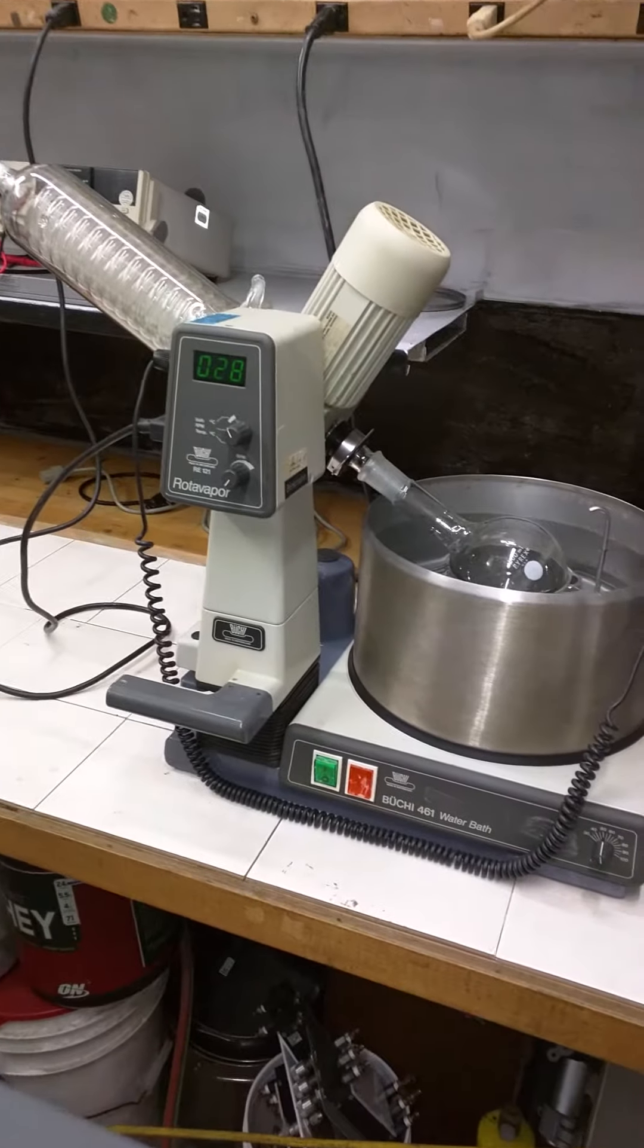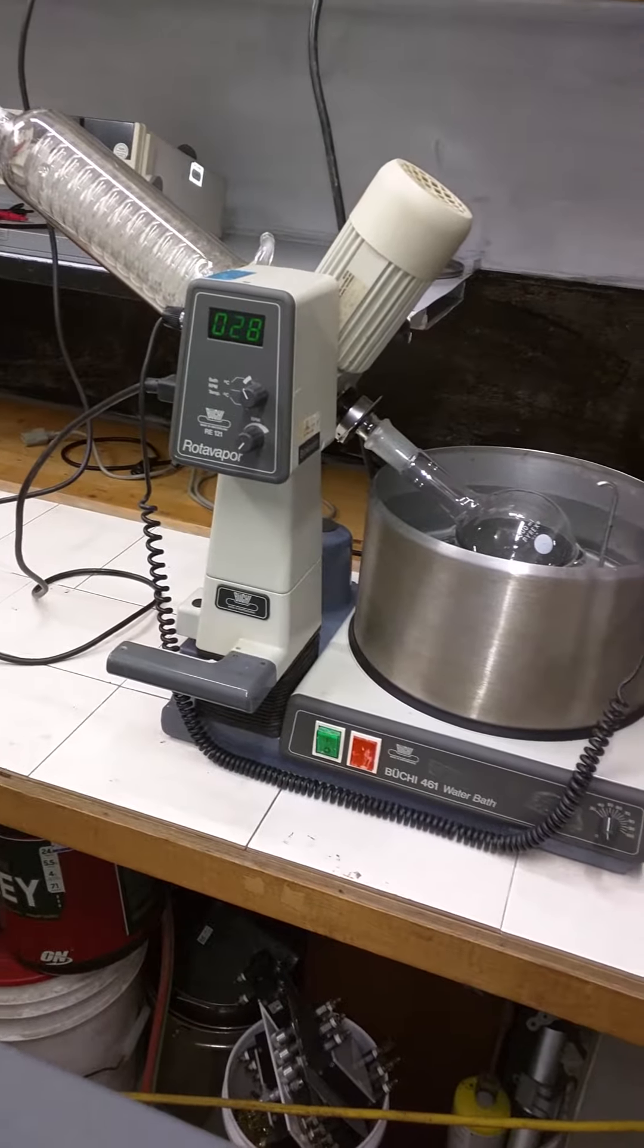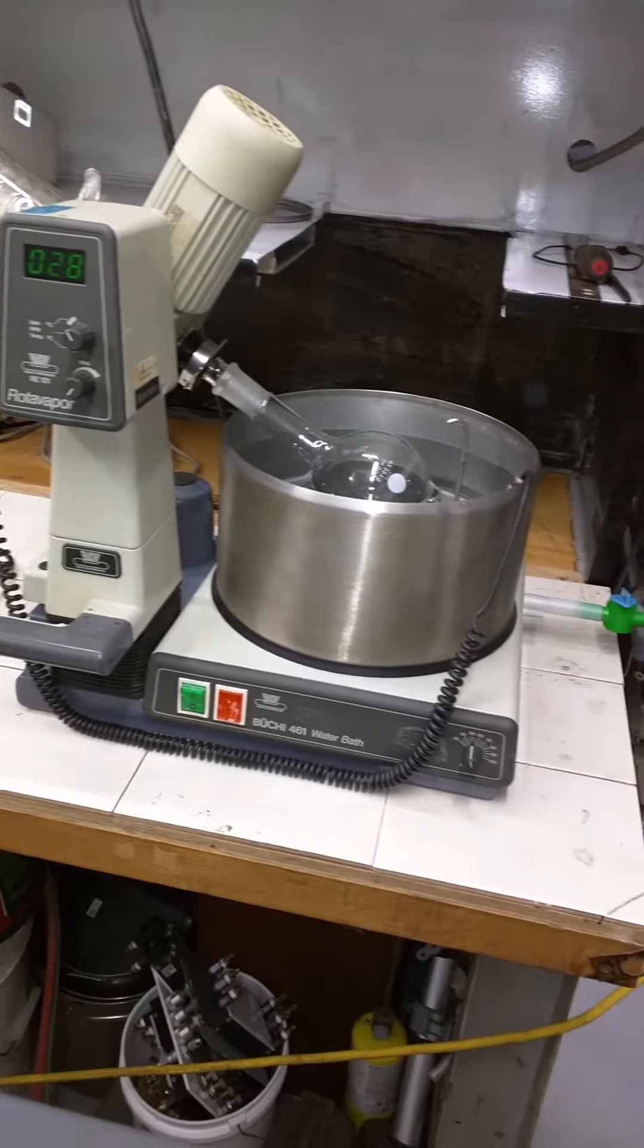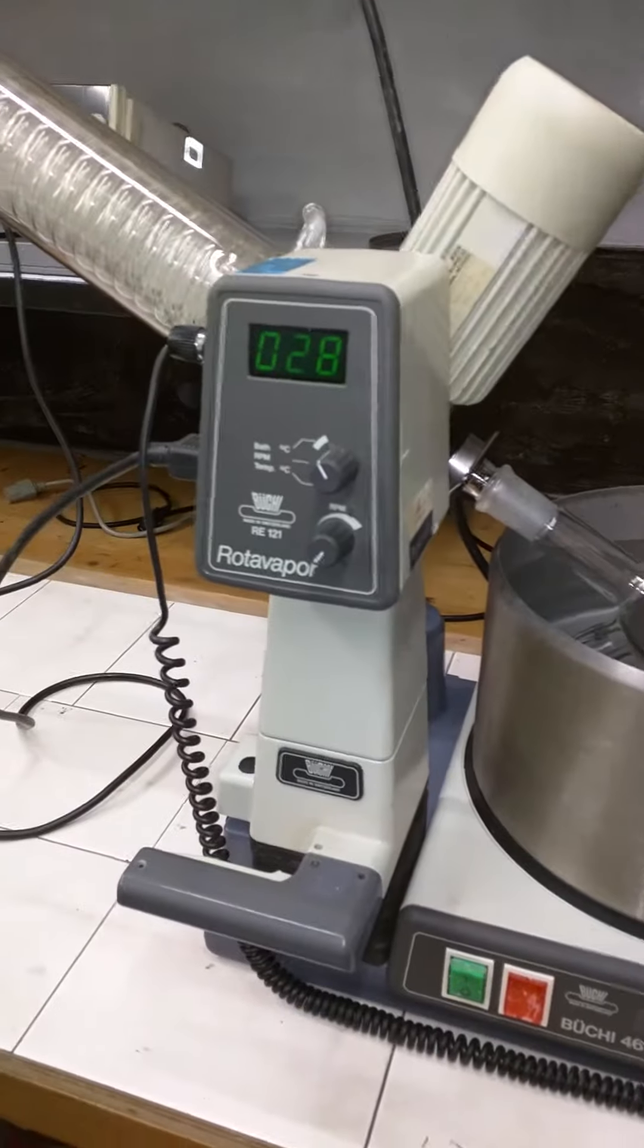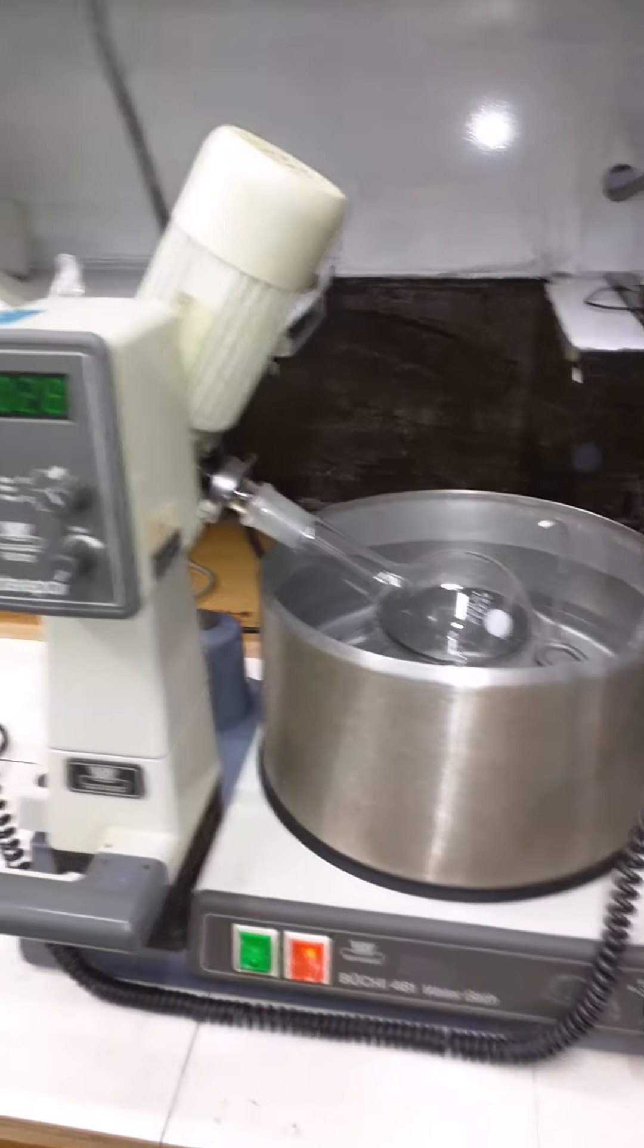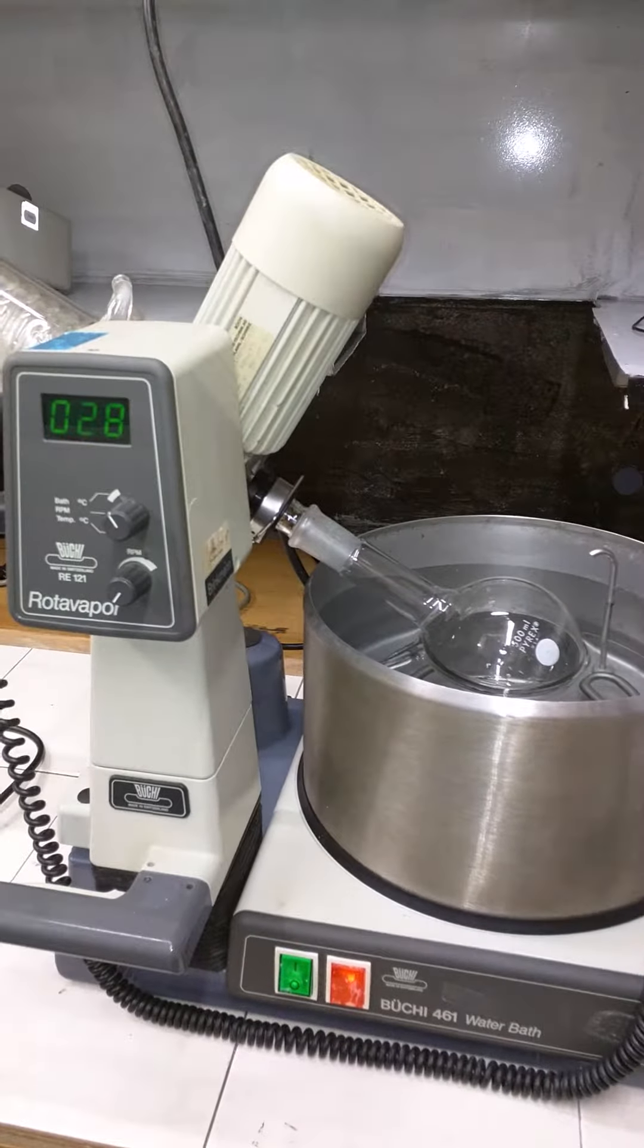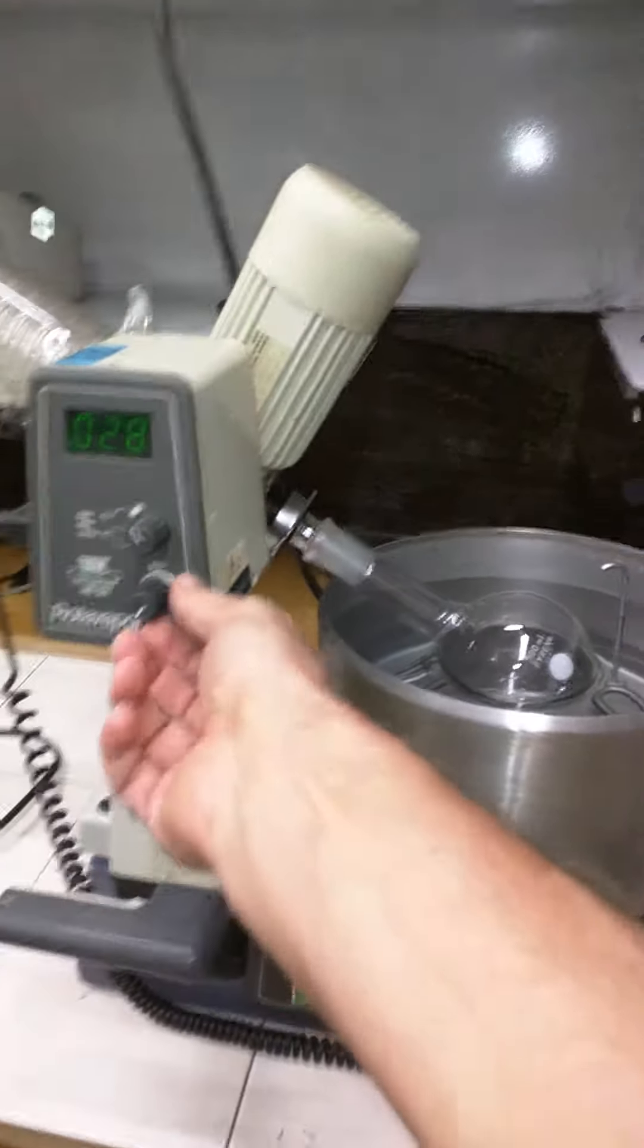This is a quick demonstration of the Buchi RE-121 rotovapor in a water bath at 28 degrees, which is ambient temperature. We're going to turn it on and it's going to start heating up pretty quickly.